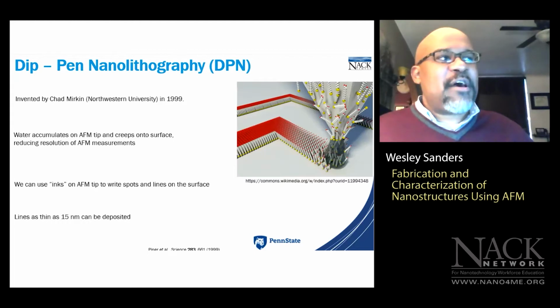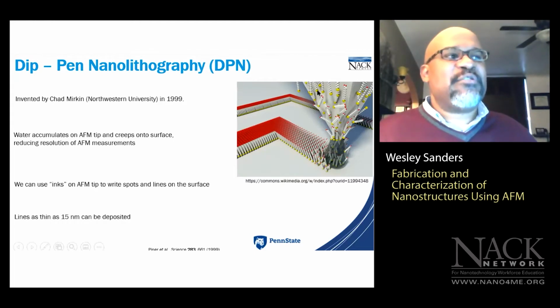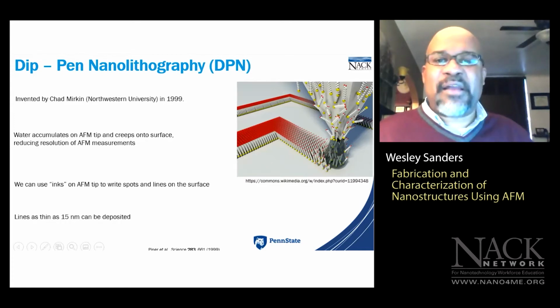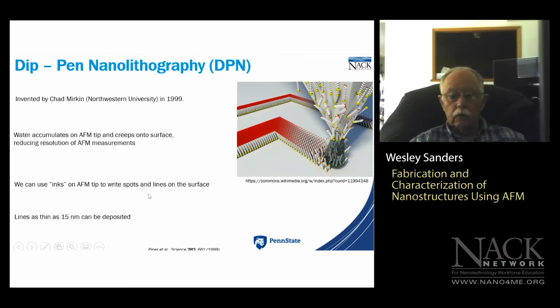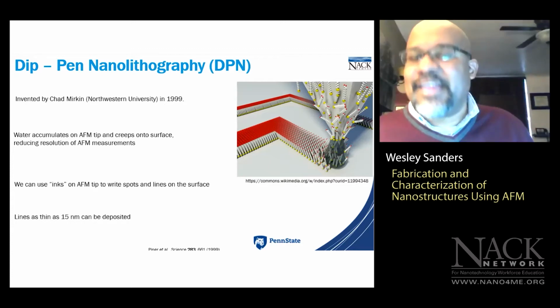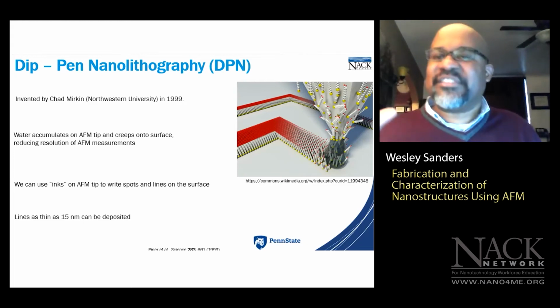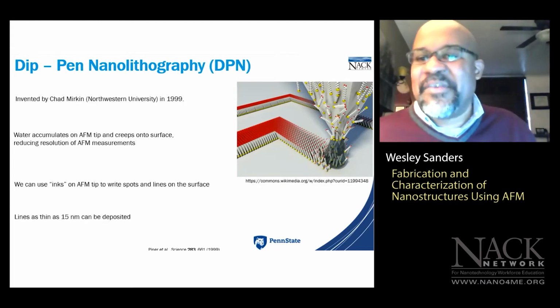Dip pen nanolithography is an additive technique. In this particular case, you're using the AFM tip to add molecules, or to deposit molecules, on the sample surface. In the first way, are you actually scraping the molecules off? Yeah, you sure are. The tip is like a snow plow in the wintertime, right? You see the plow plowing the roads. It's the exact same thing.